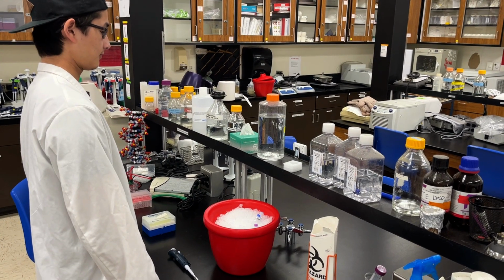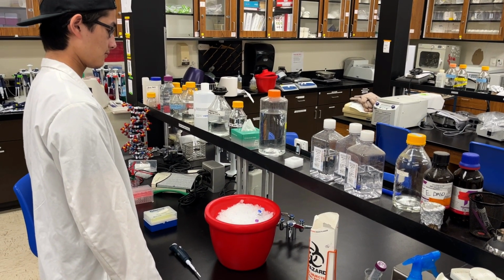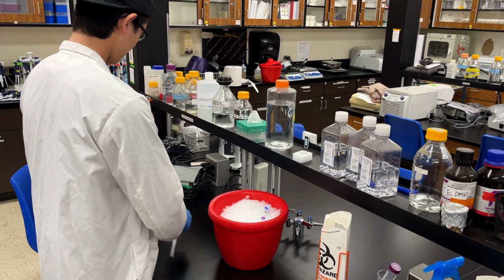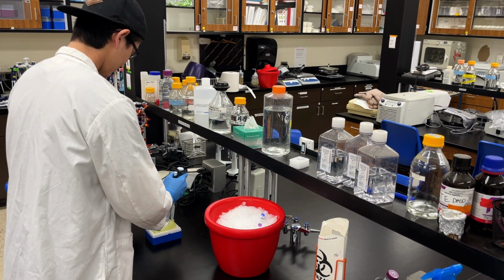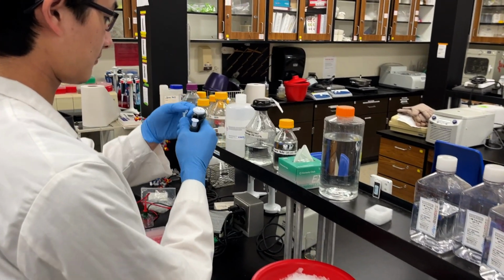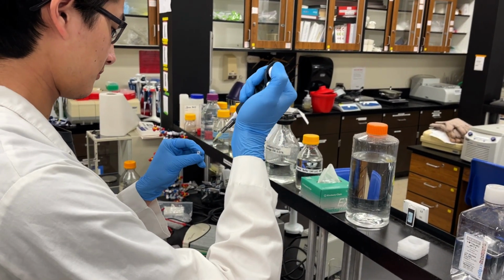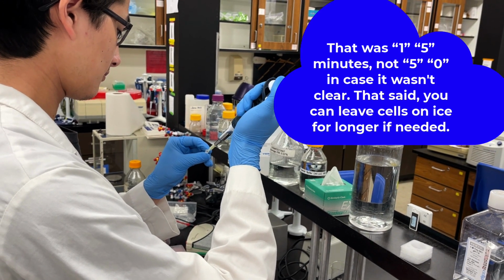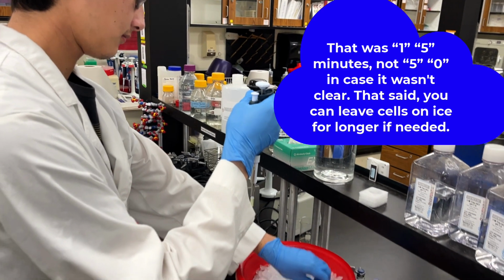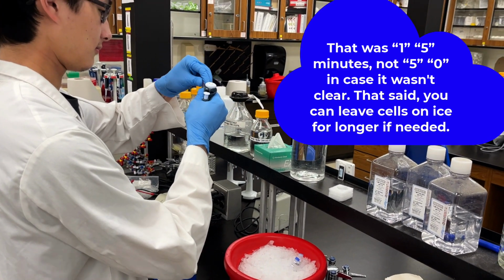So this is Jaden. He's been working on a particularly tough cloning assignment. We're hoping that we can get a successful transformation, which means that the plasmid has been formed and the gene has been cloned. He allowed the competent cells to thaw on ice. It takes about 15 minutes or so. Remember, gotta be gentle. And he takes his cloning reaction, this is a Gibson Assembly, I believe, and pipettes it and mixes it with the cells.